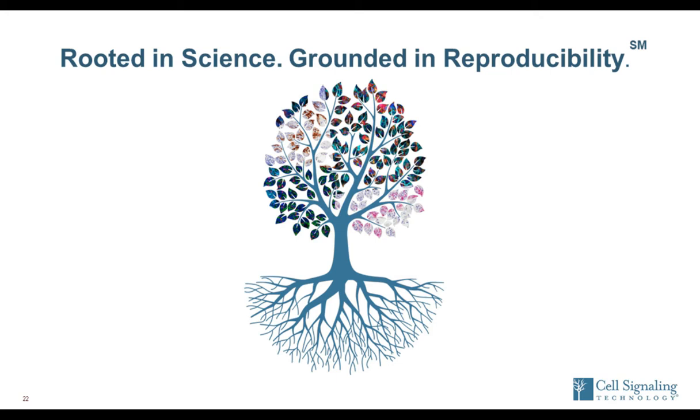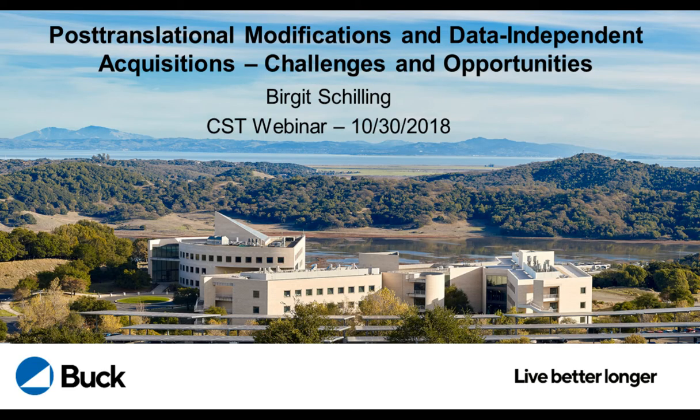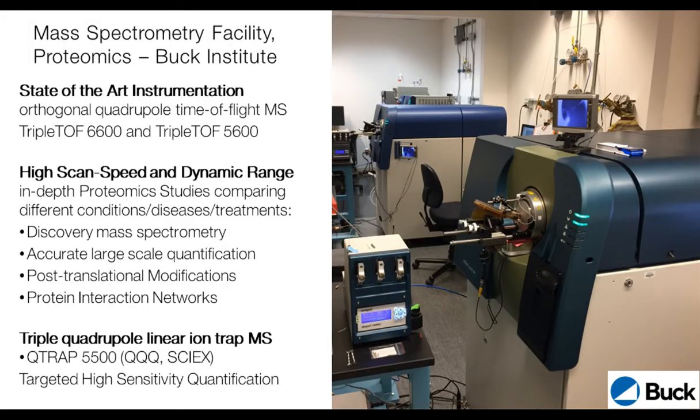Well, thank you, Matt. Yeah, so this was quite a nice introduction, in fact, for my talk, because I will show you a little bit of data on how we are using these tools that Matt just described and really apply them to relevant biological projects that we are performing here at the Buck Institute for Research on Aging. You'll see a picture here. On the second picture, you can see our mass spec core and our instrumentation. We do have several high-resolution instruments available.